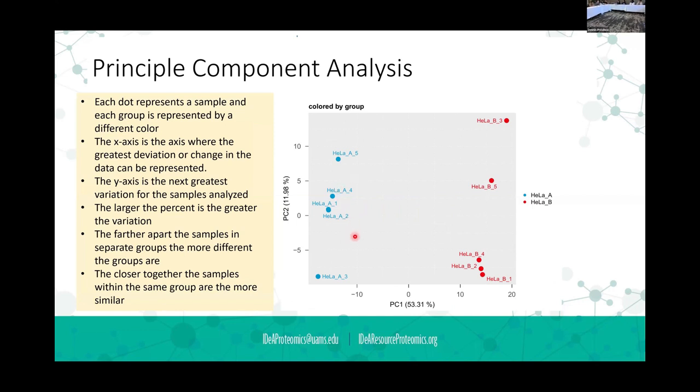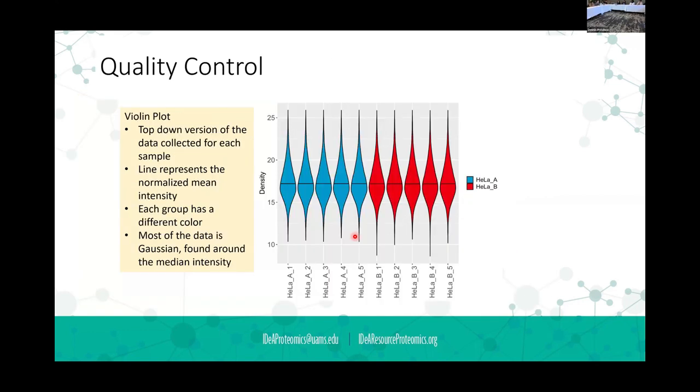address that. Yes, ma'am. In that case, like one of the samples looks different from others, which means it is not normalized, right? So does this normalization have to be carried out during the sample preparation or after the mass spec analysis? Where should this sort of normalization be? So the question is this normalization here is all done on the data afterwards, but it is pointing to, essentially, you're right, we have done another normalization before the experiment began when we did our protein quant.